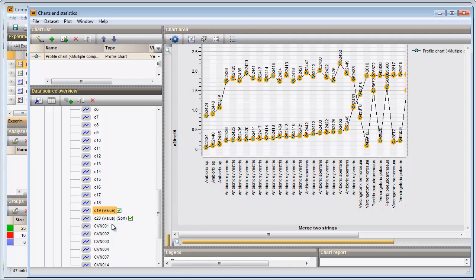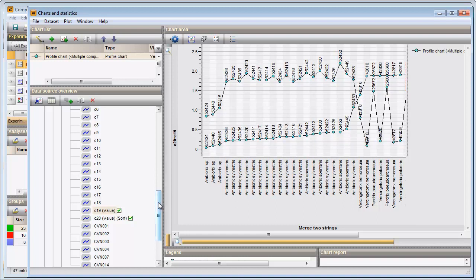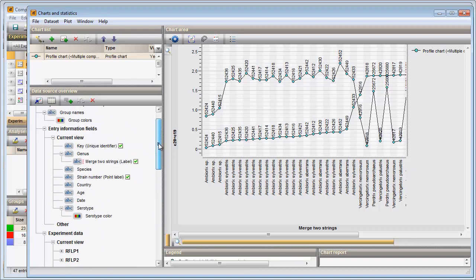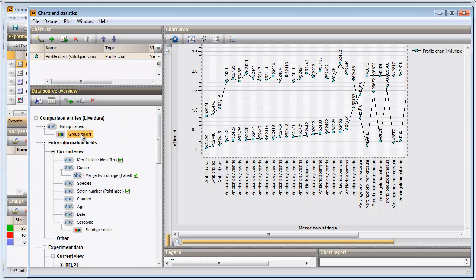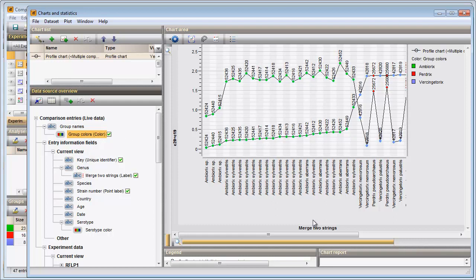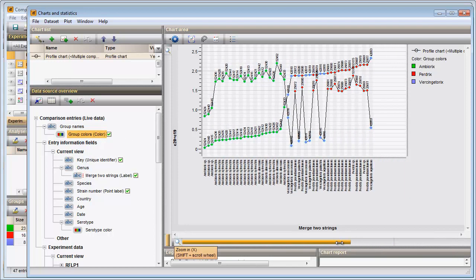The chart now includes two profiles. Pressing F4 will unselect the current selection in all windows. Finally, I will plot the group colors of my genus groups on the chart. I right-click on the color grouping of my comparison and choose the color option. The data points are now colored based on the genus names.